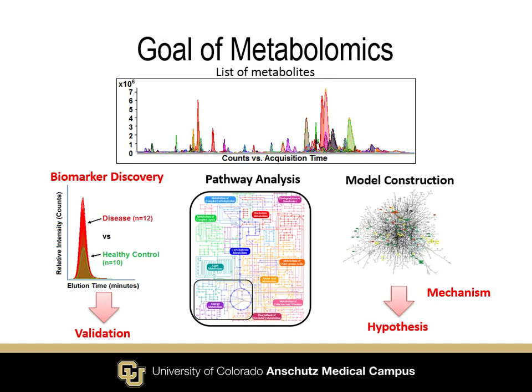And so let's say we have some type of disease versus healthy control where we have some type of fold change. We want to go on and validate those either using targeted mass spectrometry or if we want to use some other type of parallel platform.